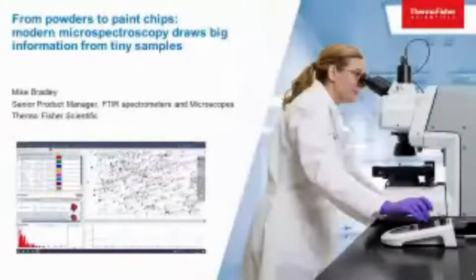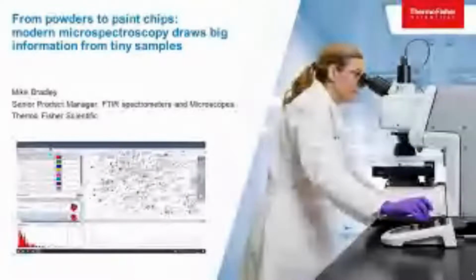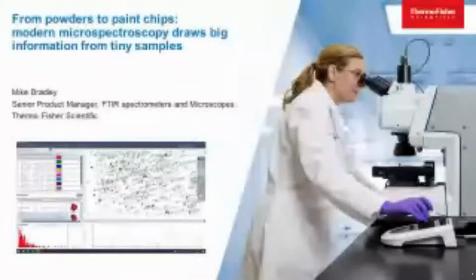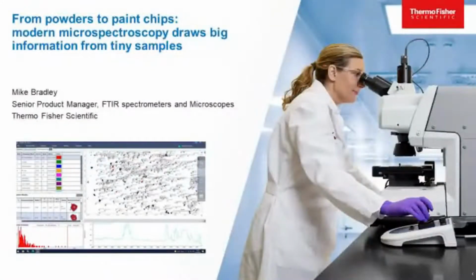I am Mike Bradley, the Senior Product Manager at Thermo Fisher Scientific for the FTIR spectrometers and microscopes. What I hope to do today is mostly a tutorial about the use and the operations of the FTIR microscopes. So I'm going to show you some about sample preparation. Actually, I can go to the first slide now and show you that.